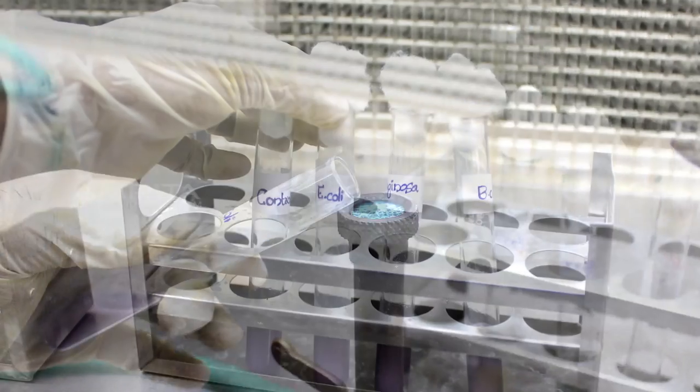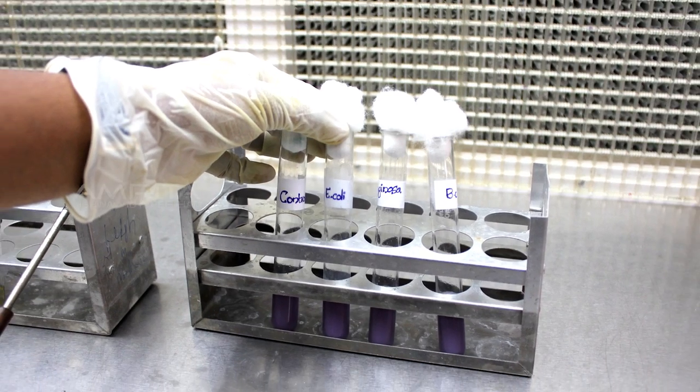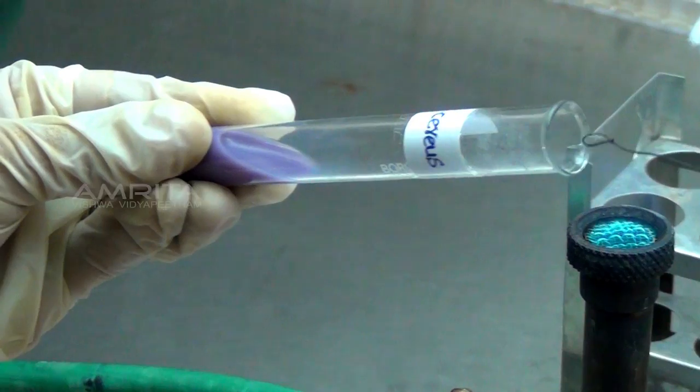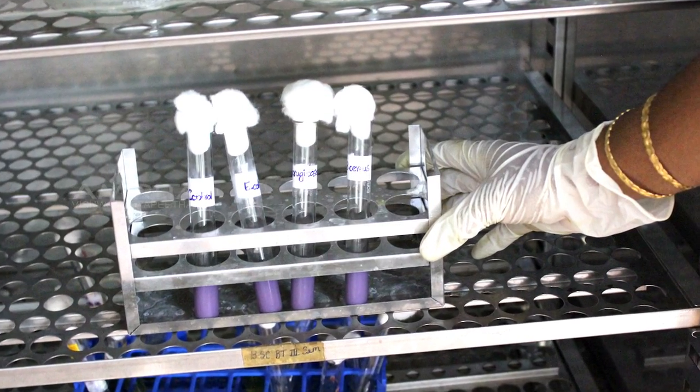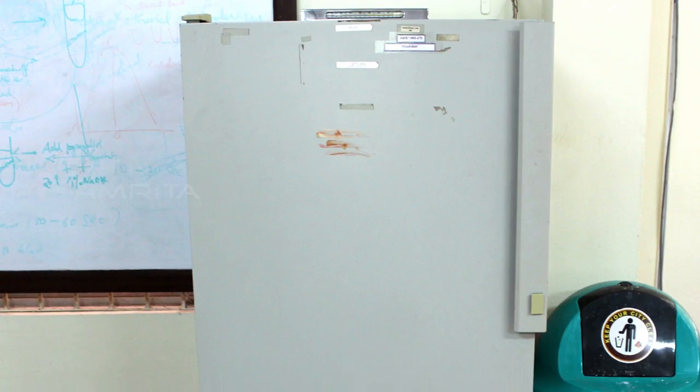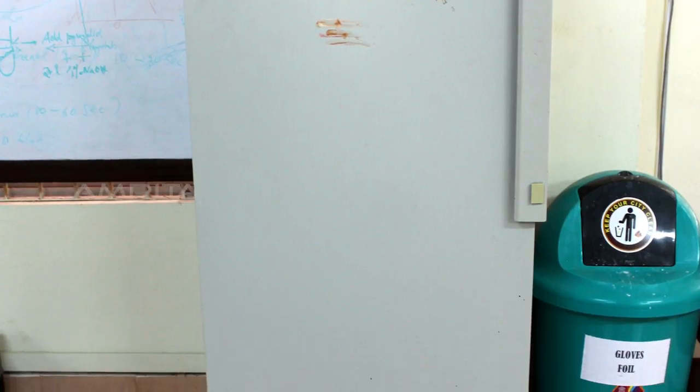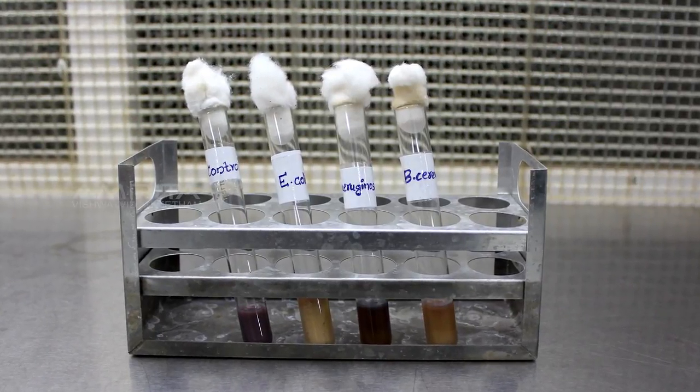Flame the mouth of the tube and place it in the rack. The other two test cultures were inoculated successively. Incubate the tubes at 37 degrees celsius for 24 to 48 hours. After incubation observe the results.